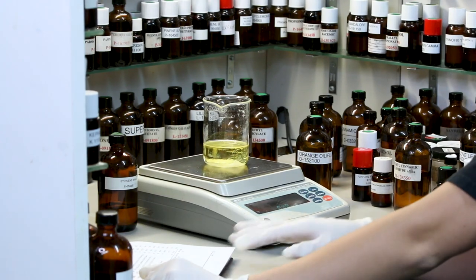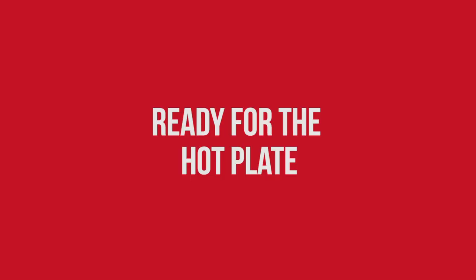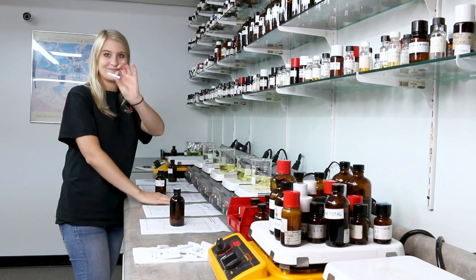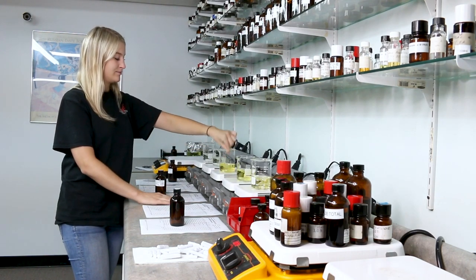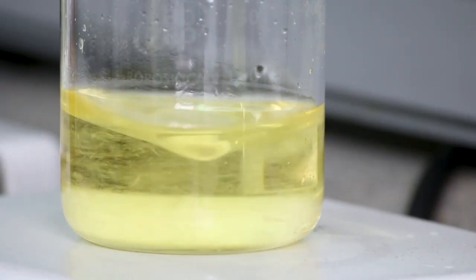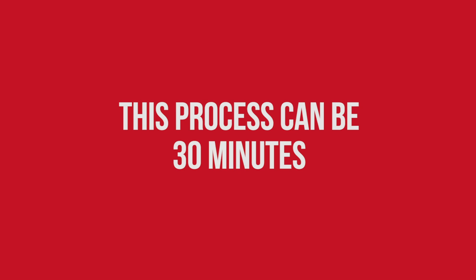Now it's off to be heated and stirred. Place a magnet into the beaker — or chuck it in there like Jada just did. We're going to let it sit on the heat at low temperature while it stirs. We're going to wait until the crystals are dissolved. This process can take up to 30 minutes.